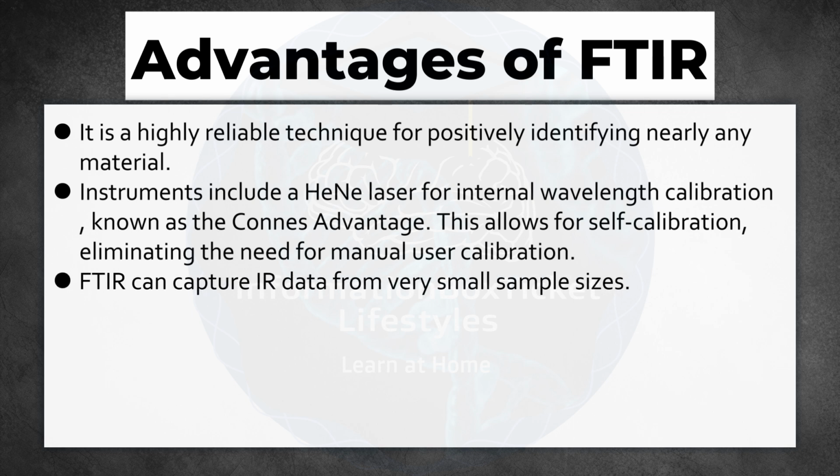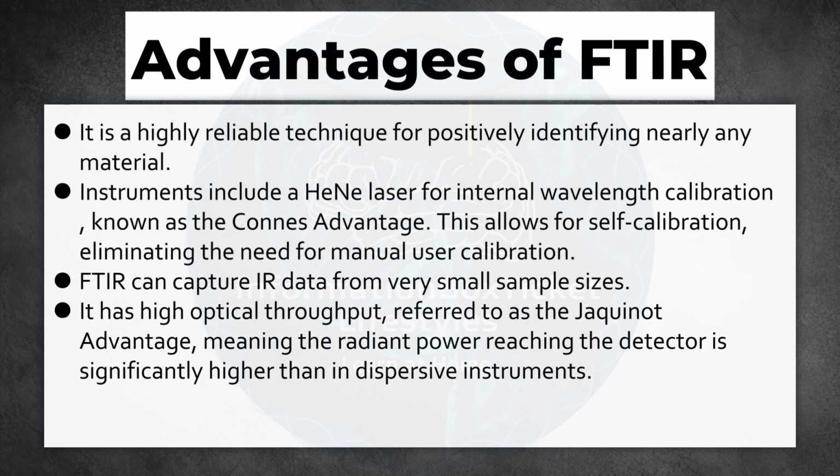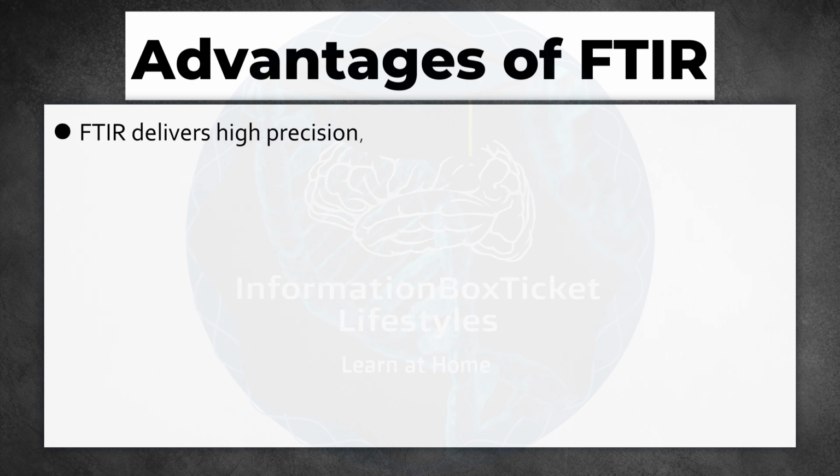FTIR can capture IR data from very small sample sizes. It has high optical throughput, referred to as the Jacquinot advantage, meaning the radiant power reaching the detector is significantly higher than in dispersive instruments.